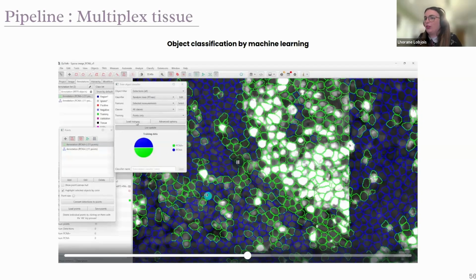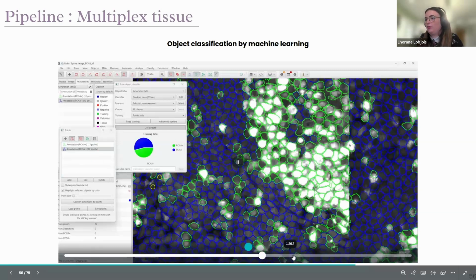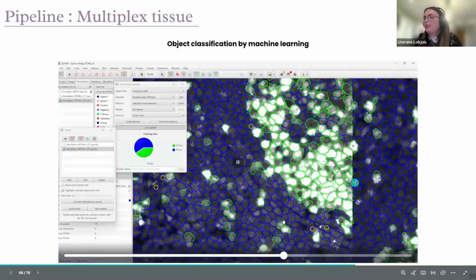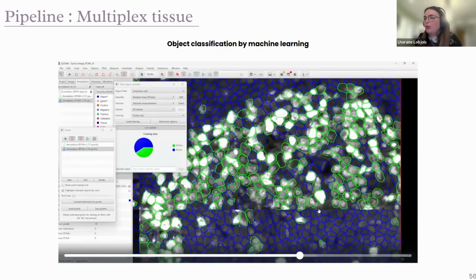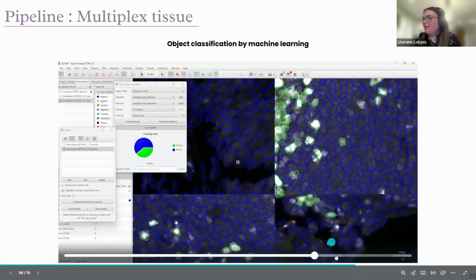If it's not great, for example some are negative for me but maybe not, I adjust it and I see it live. And you can do it as many times as you want. It could take a lot of time, but it's necessary to do it the best you can, because when you apply that on all the images in your project, imagine you have 100 images, you should be happy afterwards when it works well from the beginning.